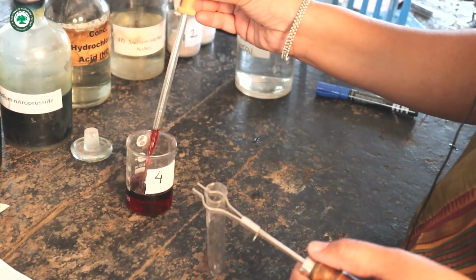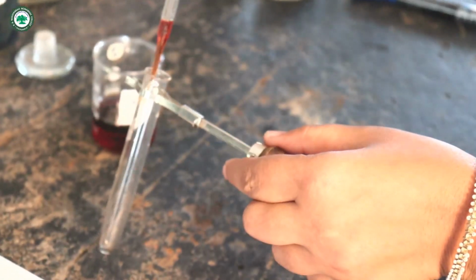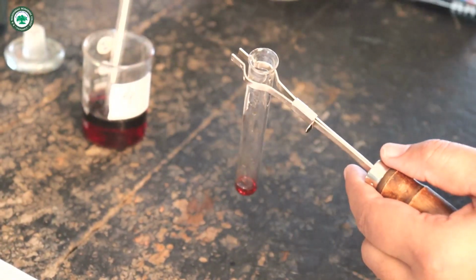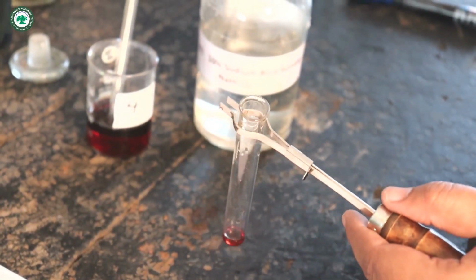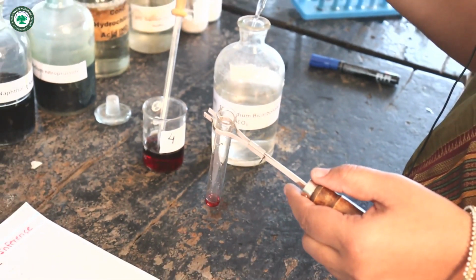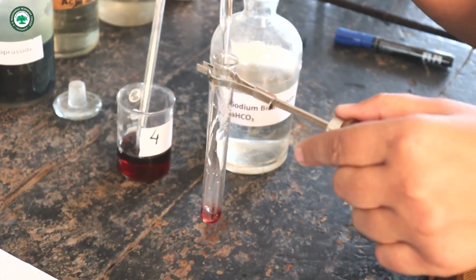Then add a small amount of compound number 4, for which functional group is to be detected. Then add 10% sodium bicarbonate. If there is brisk effervescence of CO2, then carboxylic group is present.